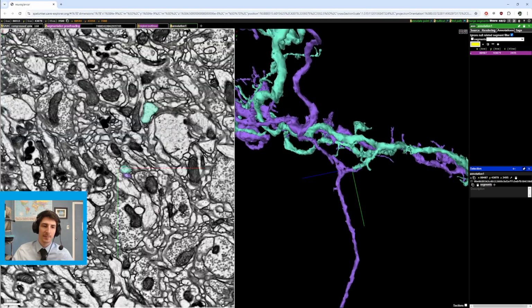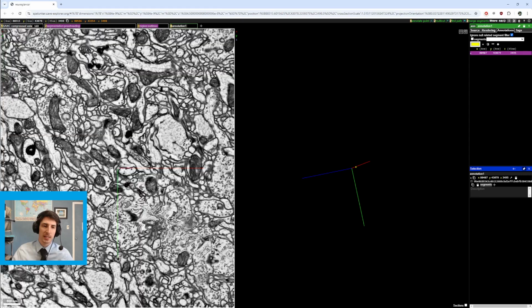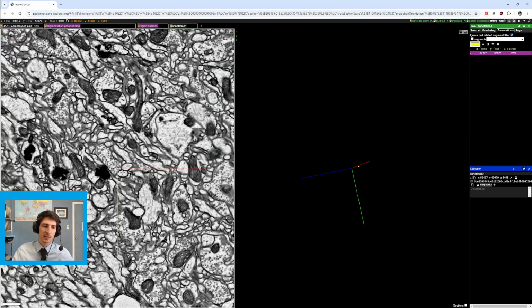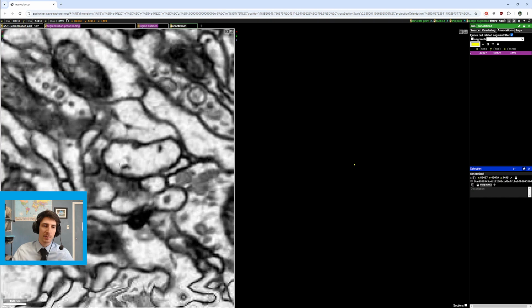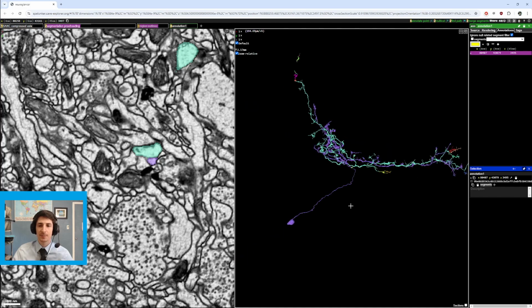Yeah. So we just have to make sure that we're tracing the correct branch here because there is a jump. So as we could follow this, we'll turn that off for now. If we follow this up two slides, it pretty much continuously goes to that. So we're pretty sure that it's this.